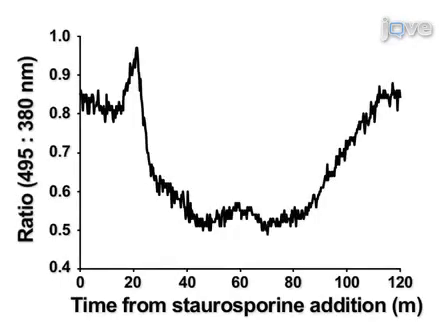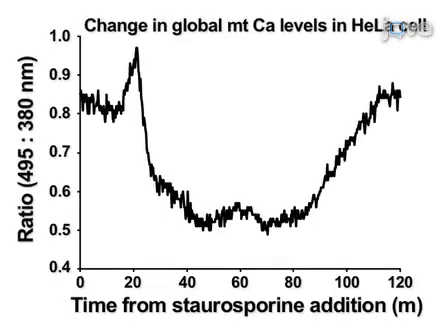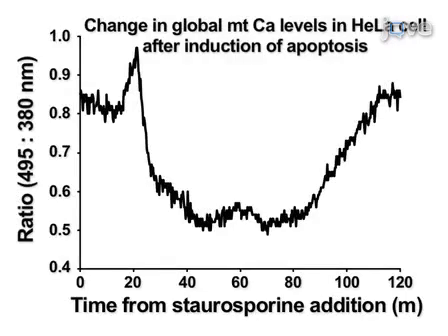This graph reveals the change in global mitochondrial calcium levels in a single HeLa cell after induction of apoptosis for 120 minutes with 0.5 micromolar staurosporin.